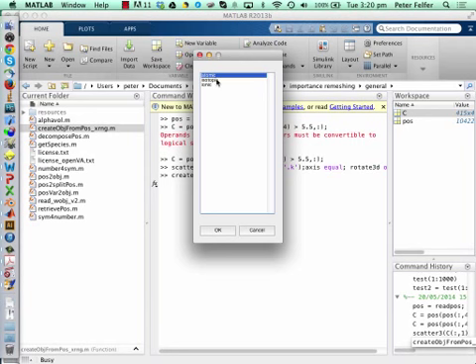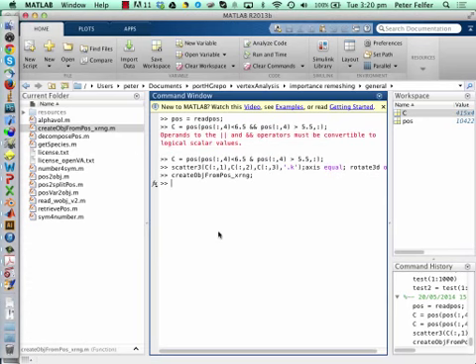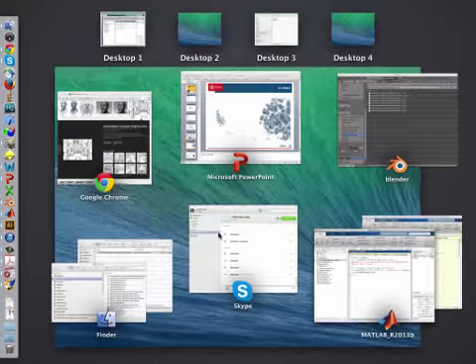So you can split it up by atomic species, isotopic species, or ionic species, and usually we do atomic species, unless you do some fancy atom probe stuff, then you'd want isotopic or ionic, depending on what you want to work on. But usually if we actually analyze the material, we just split out by atomic. I don't know why it asks me twice. And now it's writing the different OBJ files. For every single atomic species in there, it writes one OBJ file.